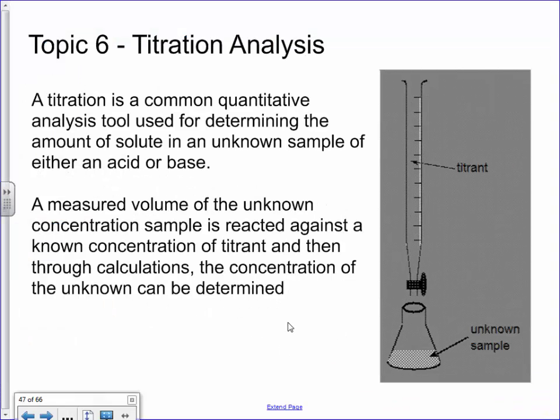Okay, let's talk through these notes on titration analysis now. Now that I've shown you what a titration looks like, let me just walk you through again, just on paper, some of the key terms and concepts that we're using here.